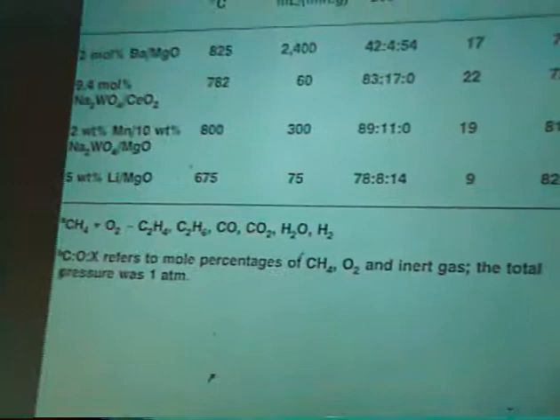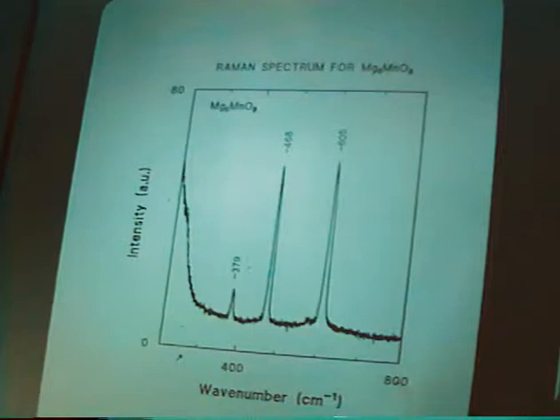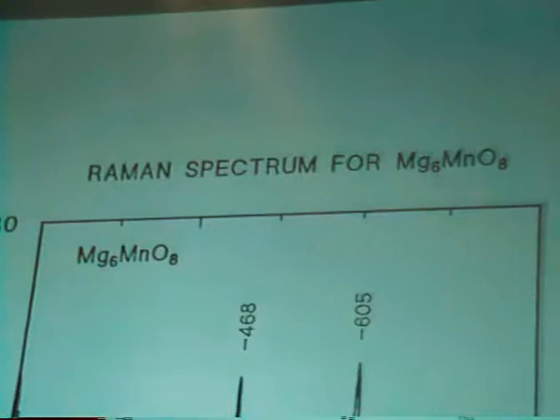The third catalyst I want to just briefly mention is the manganese sodium tungstate magnesium oxide. First of all, in preparation for our interpretation of the actual catalyst, using literature techniques, we prepared pure samples of Mg6MnO8 and have identified them by X-ray diffraction. And as far as I know, this is the first Raman spectrum of that material.